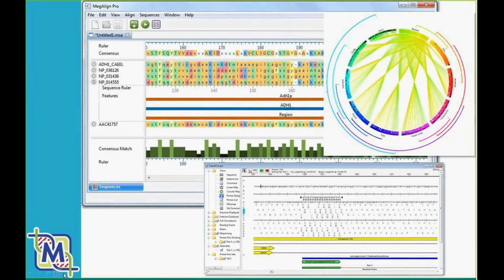And that includes things like phylogenetic alignments, multiple sequence alignments, primer design, different ways to edit and annotate sequences. So it's been a suite of tools that we've had for over 30 years. There's wide-ranging function, and recently we focused on some expanded functionality for annotation.